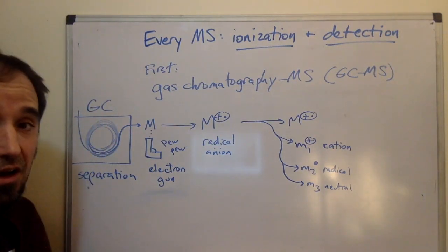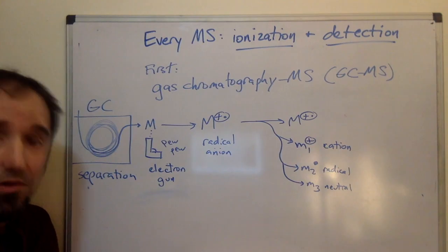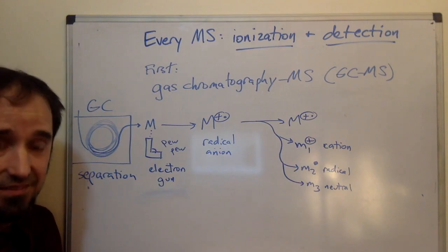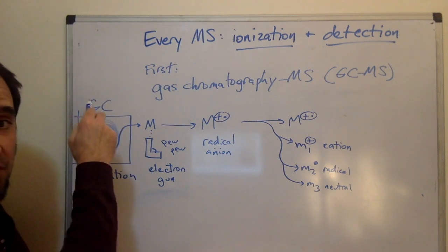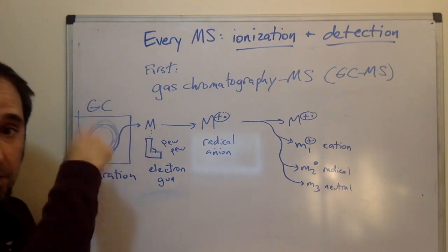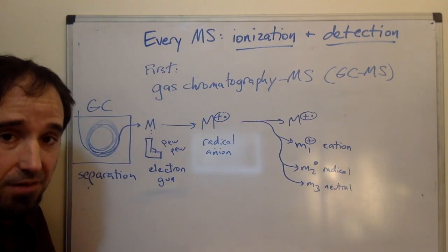Okay, so our GC oven is simply the same kind of chromatography that you learned about with TLC, right? We're separating things on the basis of their polarity, essentially. But here, this is a separation method. We put a mixture of things in, we heat it up so it gets in the gas phase, it runs through a 30-meter column, and comes out separated by component, okay?